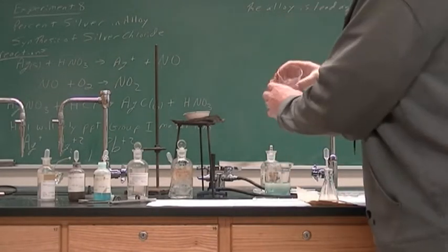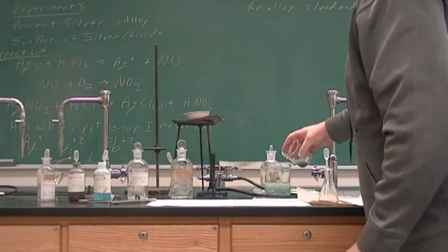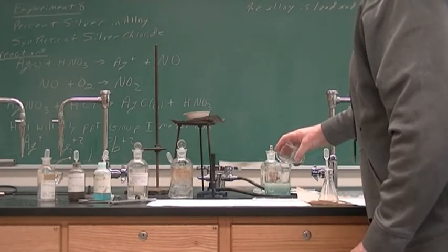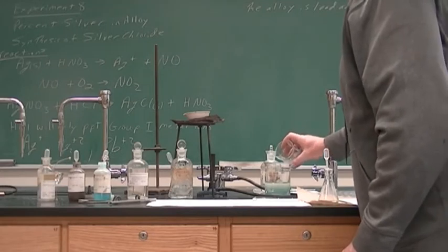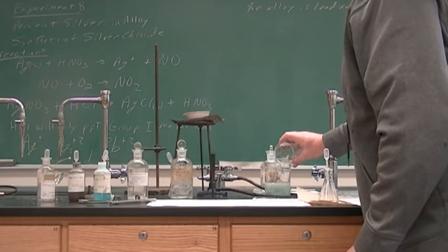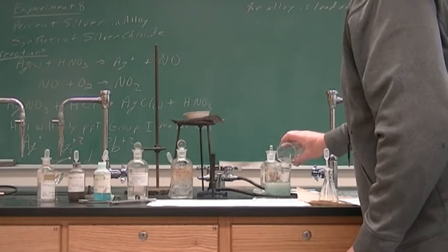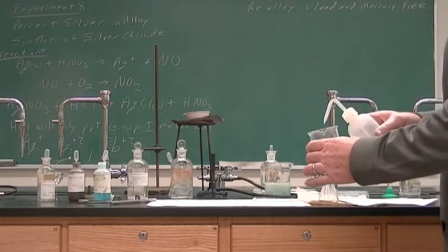All right, we're washing with that, and then we just decant that solution into this beaker as well. We got a bit of a floating problem. Again, we're going to lose some silver. I'm looking more for the purity than I am percentages right now, so I just want this to be a nice clean silver.